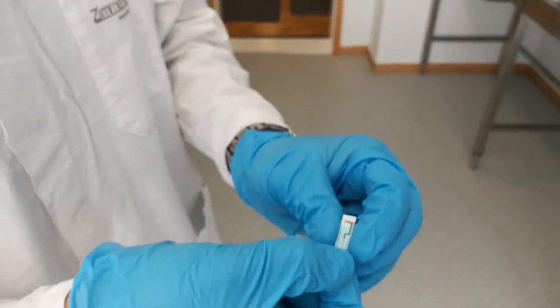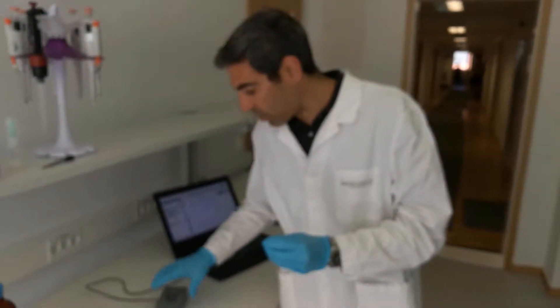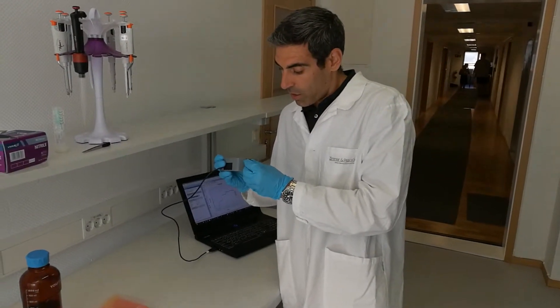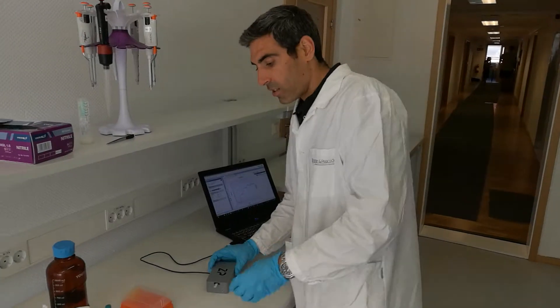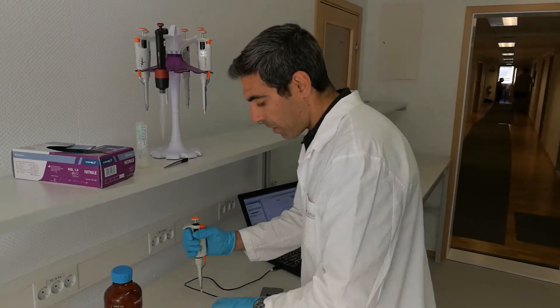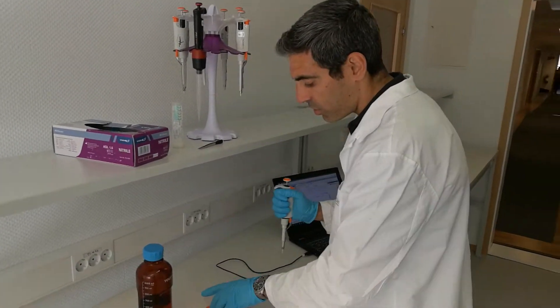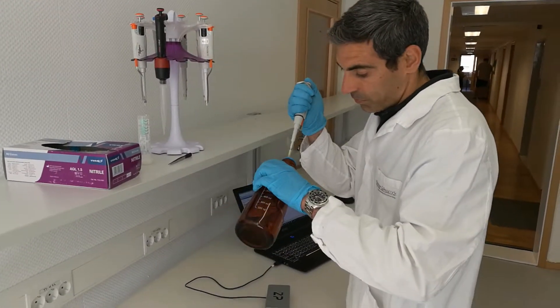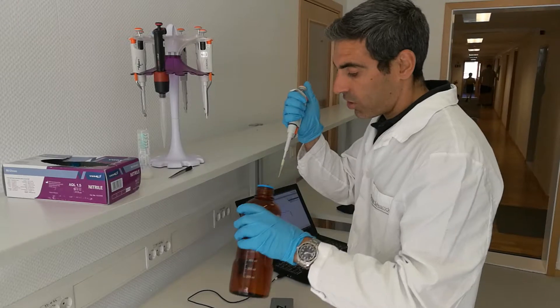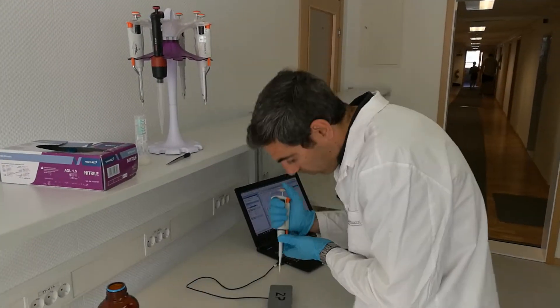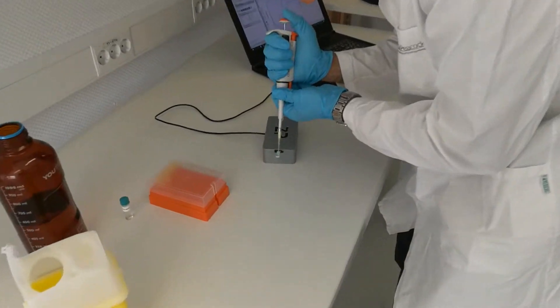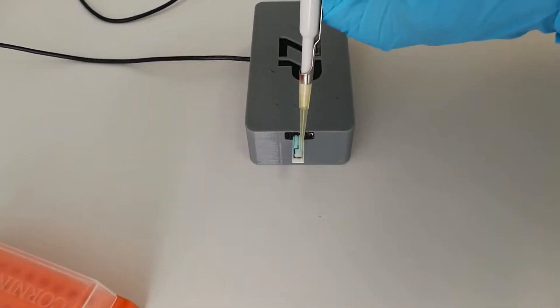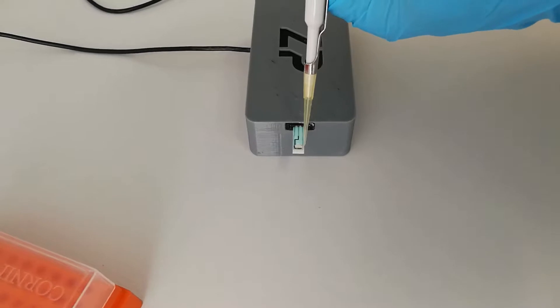So what we're going to do is connect this sensor to a potentiostat box with a connector. Once this is connected, we are going to pipette 50 microliters of PBS solution onto the electrode to create our electrochemical cell. Just make sure you cover the electrodes well.